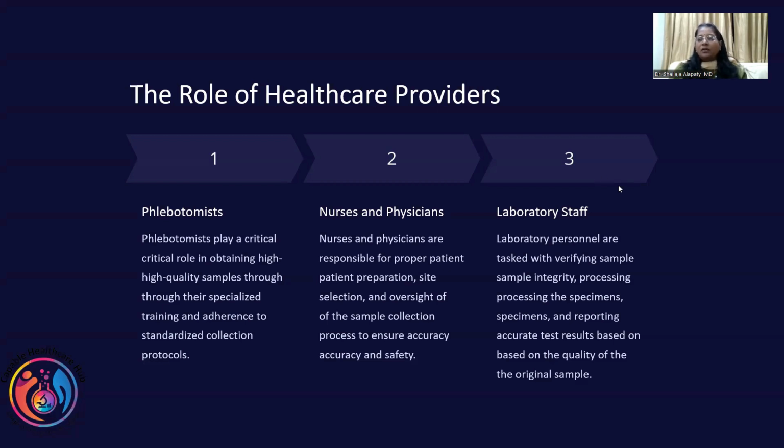And all the lab staff need to verify sample integrity. Processing the specimens and reporting are based on the quality of the original sample.